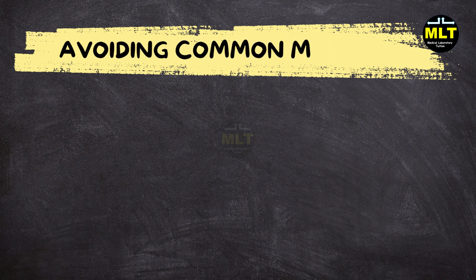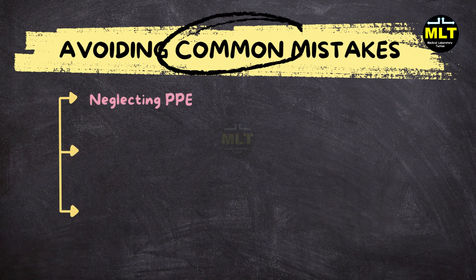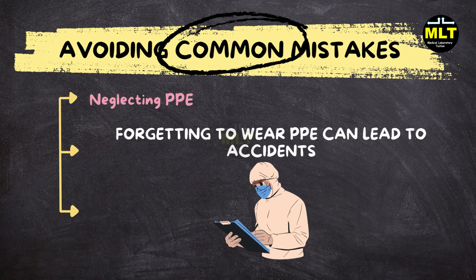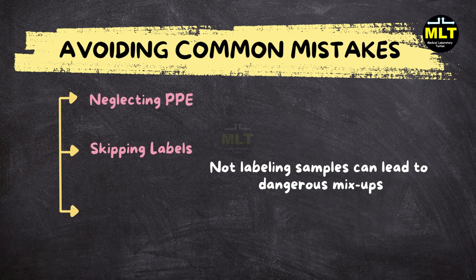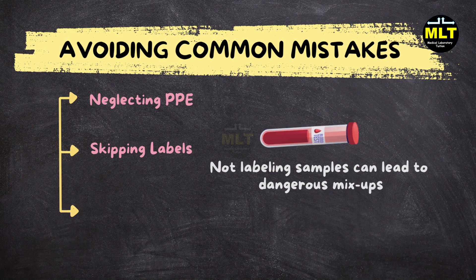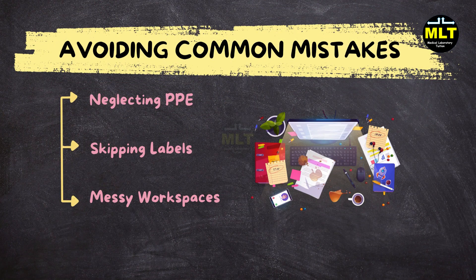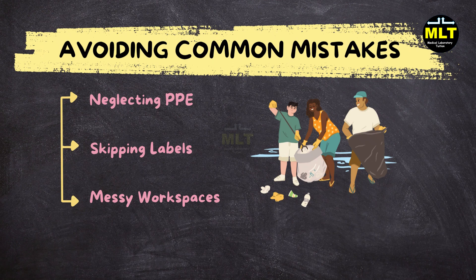Section 6: Avoiding Common Mistakes. Let's look at some common mistakes made in the lab. Neglecting PPE: Forgetting to wear PPE can lead to accidents. Always prioritize your safety by wearing the necessary protective gear. Skipping labels: Not labeling samples can lead to dangerous mix-ups. Make labeling a standard part of your routine. Messy workspaces: A cluttered lab can lead to accidents. Develop a habit of cleaning up after yourself to maintain a safe environment.